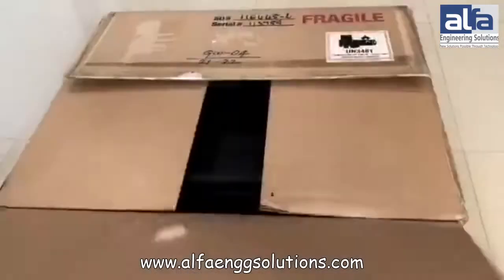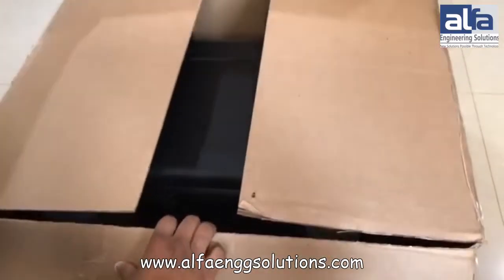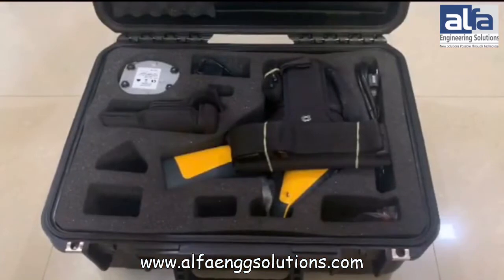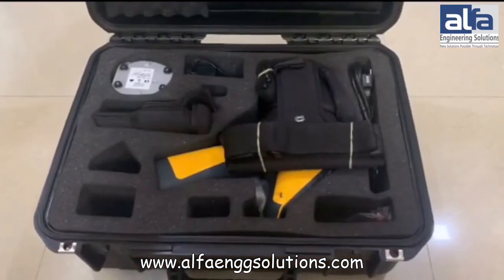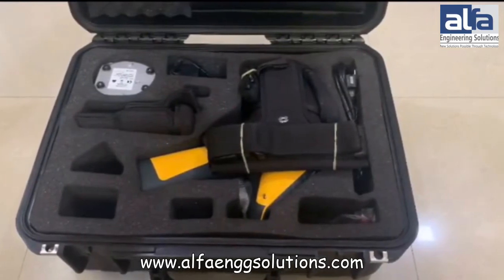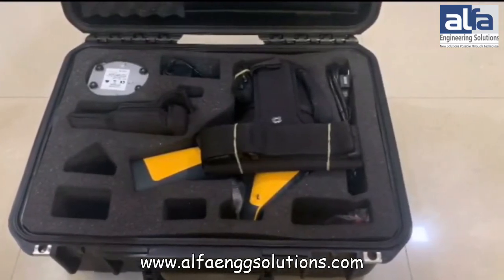We are doing the unboxing of the Thermo Fisher Niton XL2 100G General Metal Analyzer. The XL2 100G Metal Analyzer provides immediate non-destructive elemental analysis of alloy materials, from titanium to nickel, as well as tramp and trace elemental analysis.